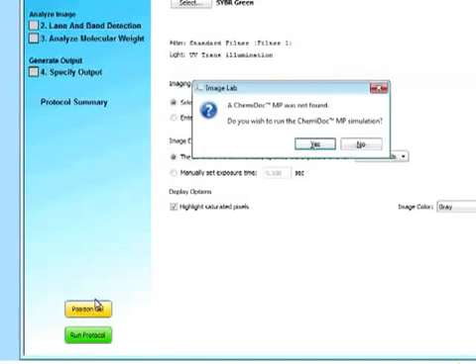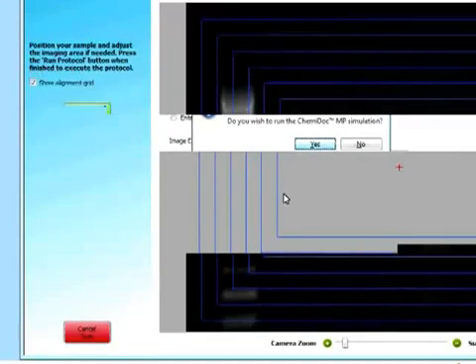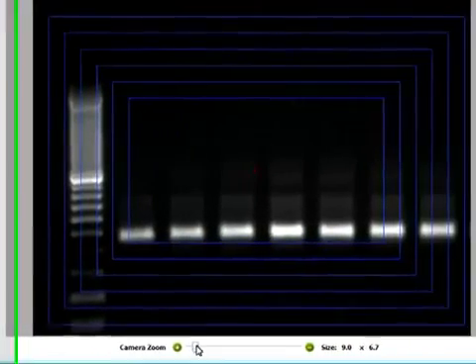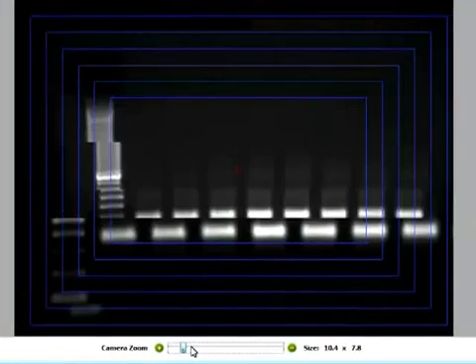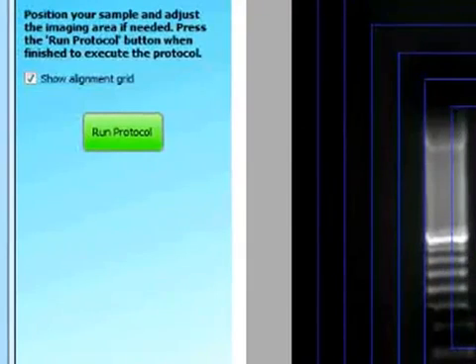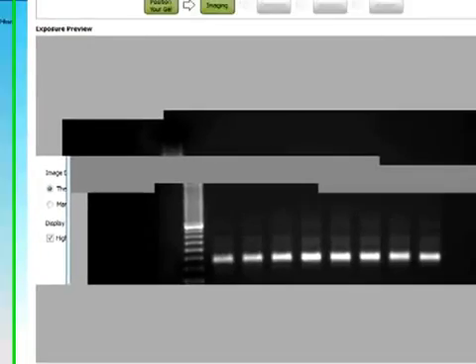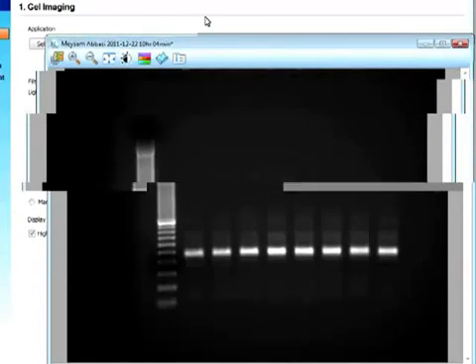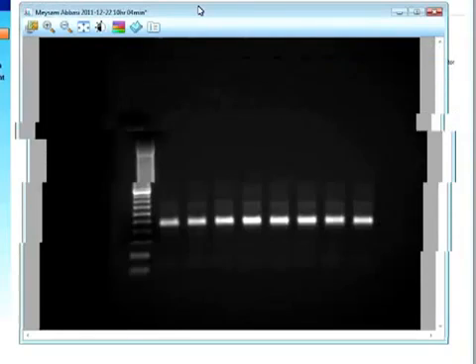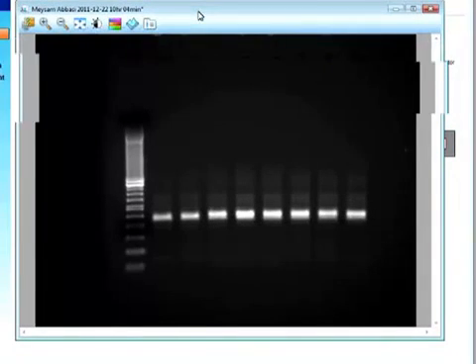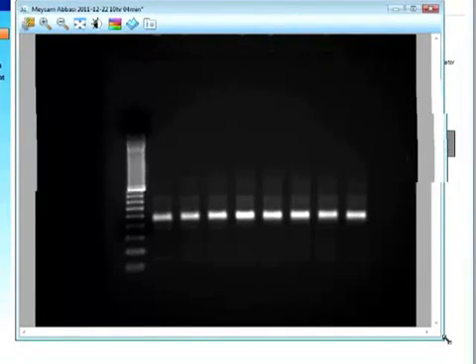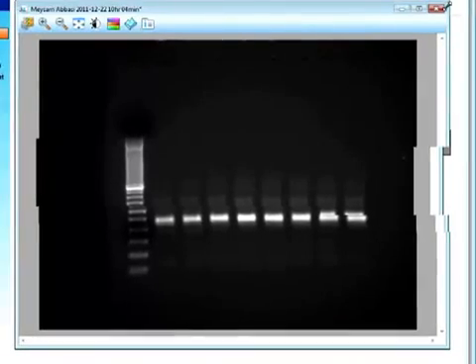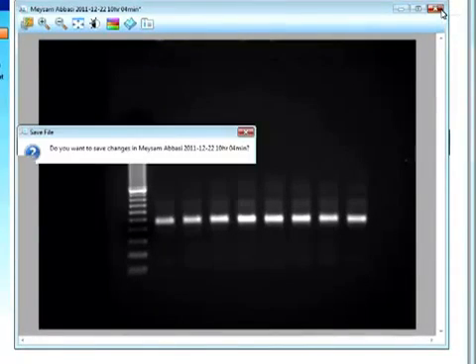The next step is the position gel. And we can select to zoom in or out in here. And then run the protocol. And there we have our image. And this is how easy it is to acquire an image of a nucleic acid gel with our ImageLab 4.0 software.